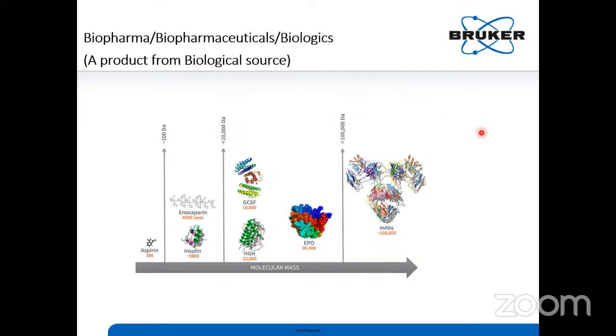So till now we discussed different models of mass spec, and what kind of mass spec we have to use for which kind of sample analysis. Fine. What is the role of mass spec in our pharma, biopharma? Hope in the last two years, the complete world could have understood the importance of life science, the importance of vaccines, antibodies, and mostly paracetamol. Everybody will remember now what the importance is.